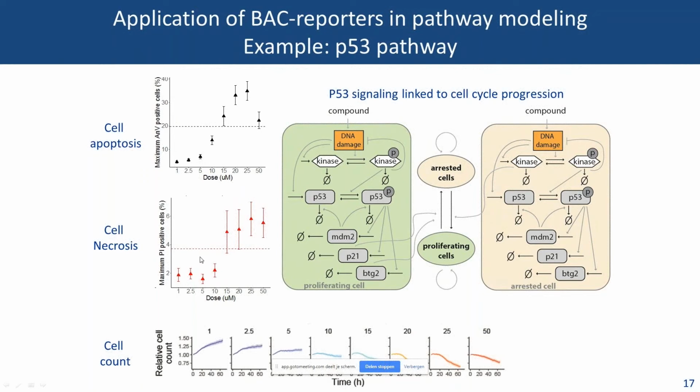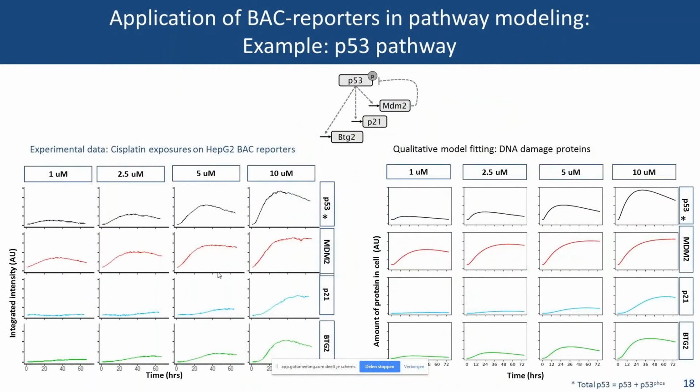So these are below the cytotox concentrations. And right now she's checking, is her model able to predict these biomarkers? And for the first concentration, it works pretty well. So here's the experimental data, in which you see very, very nice dose-dependent induction of these pathways, these biomarkers. And this is the qualitative fit, so her ODE model predictions. You can see it nicely fits with the actual data. And this is just with a very simple ODE model, so it's quite amazing.